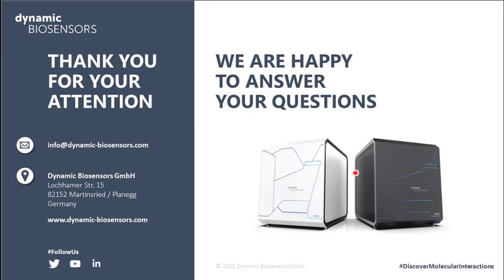Thank you. So the previous questioner has clarified that by tumbling, he was referring to including rebinding events. So I guess it's looking at antibodies binding at the same time to both targets versus rebinding events. And how do we differentiate these different types of binding? Thank you very much for the clarification.